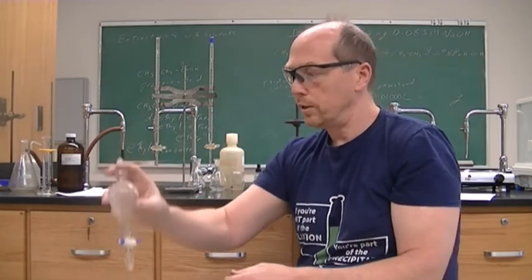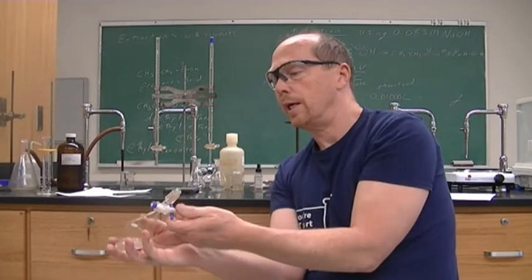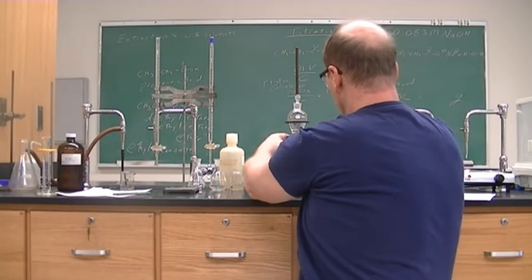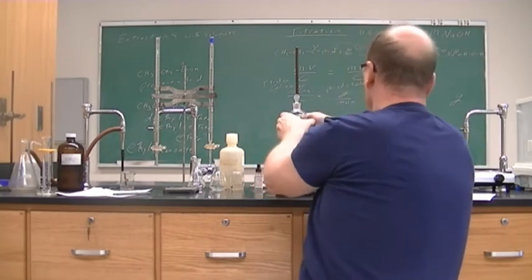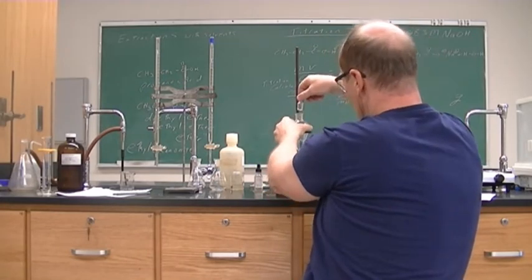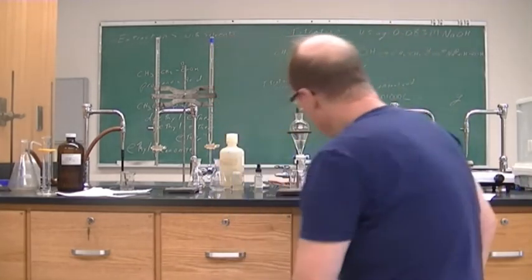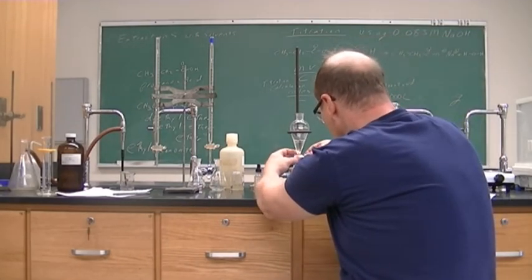So it is thoroughly mixed up. All of the ether is interacting with the aqueous layer, taking out the propanoic acid. Okay, put it back into our beaker again. Again, I should have left that on there to show you what it does if you don't remove it. But anyway, the water layer will stop coming out once the pressure gets too much from leaving the lid on.